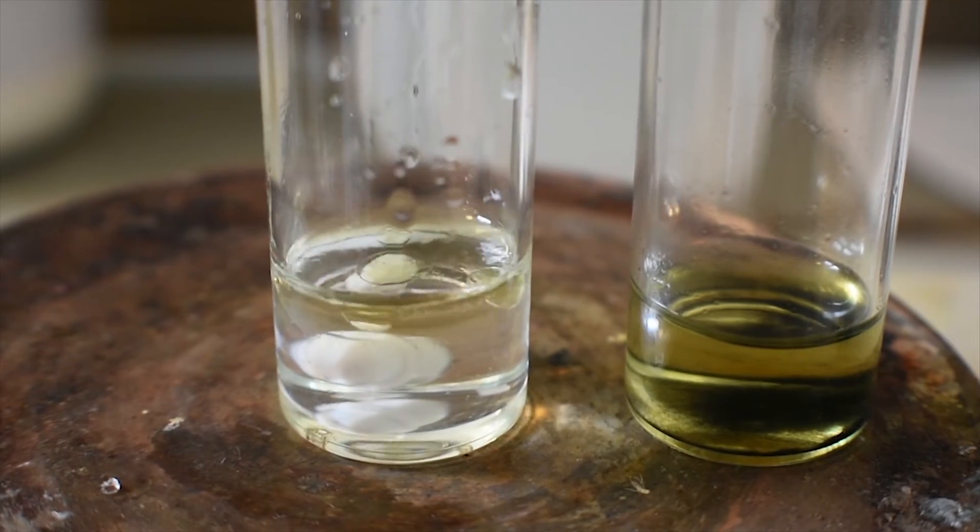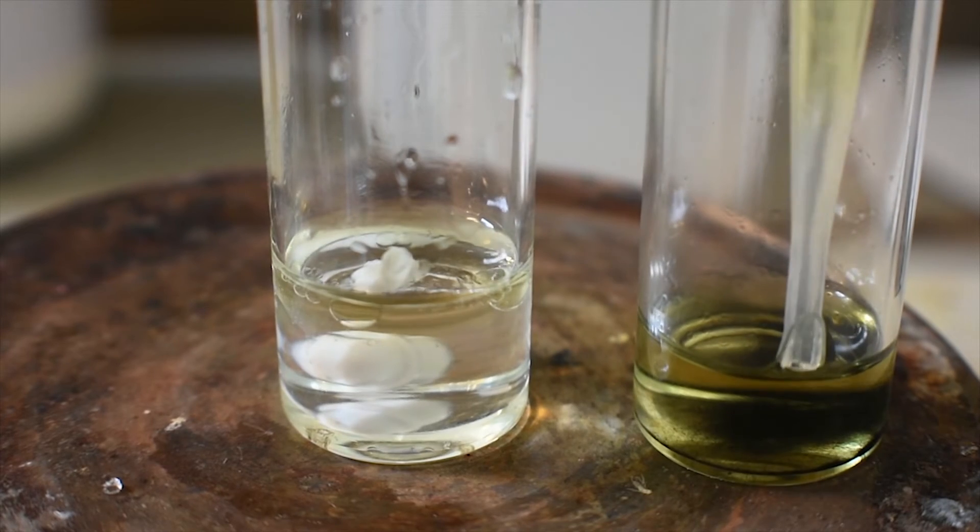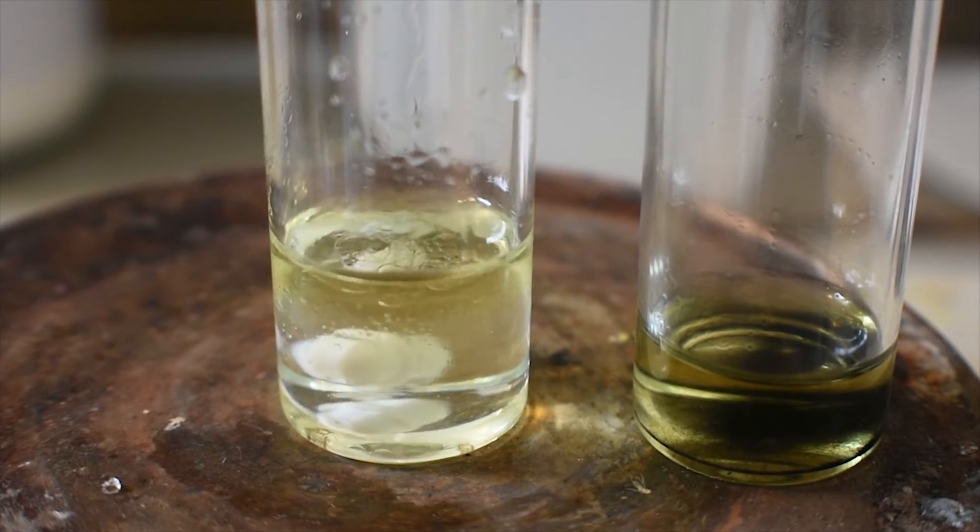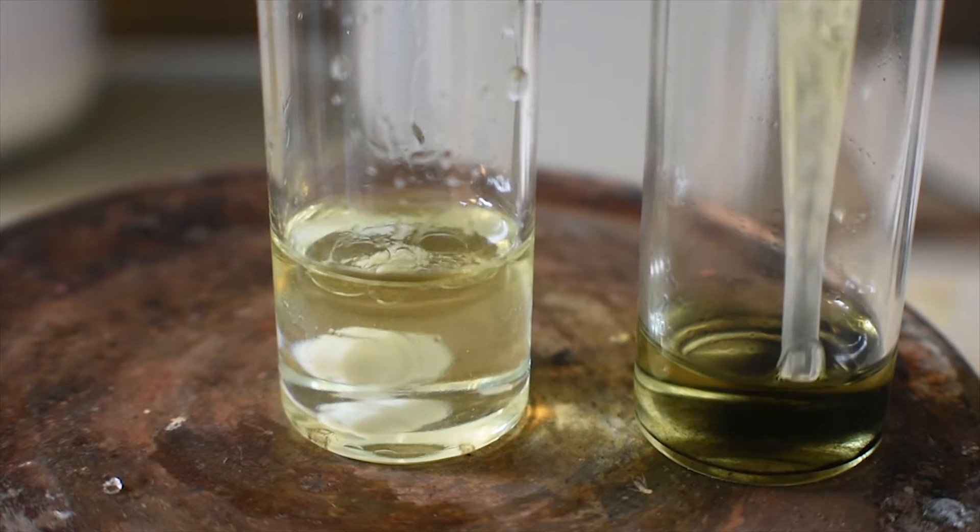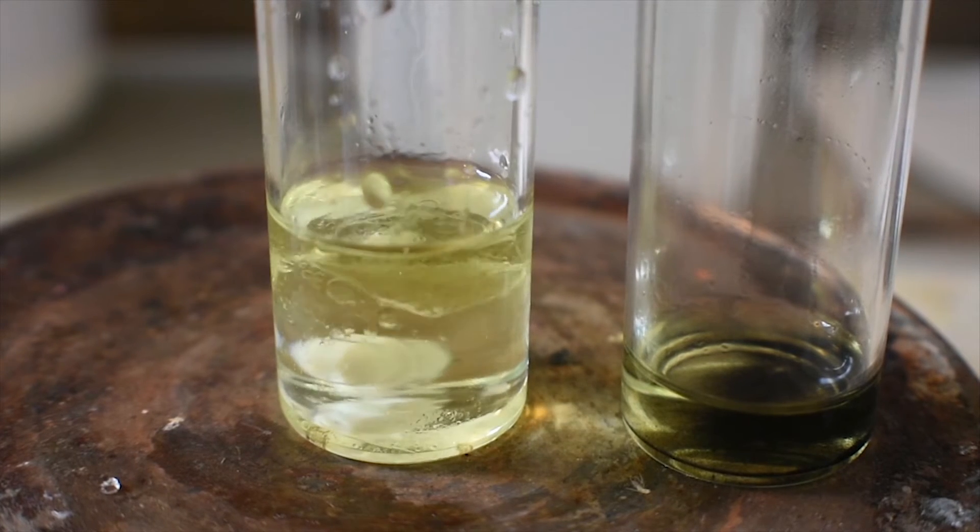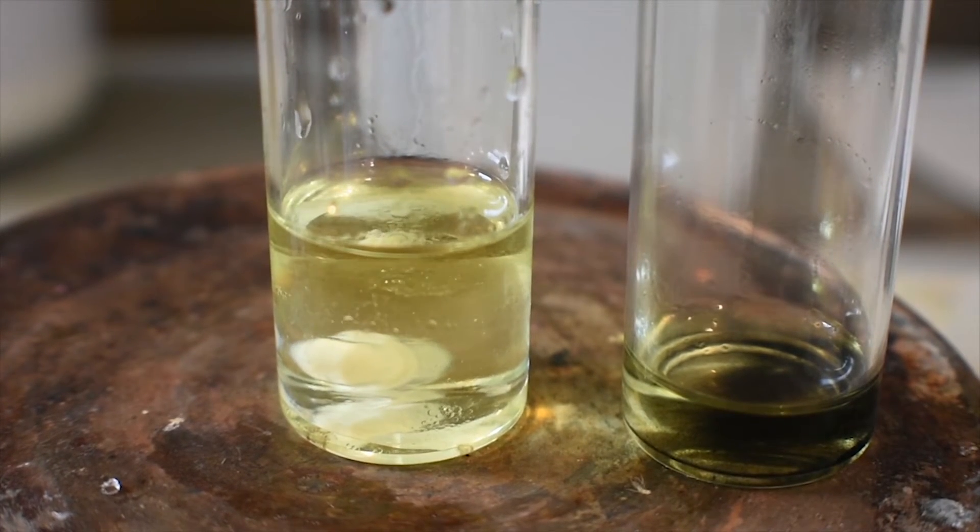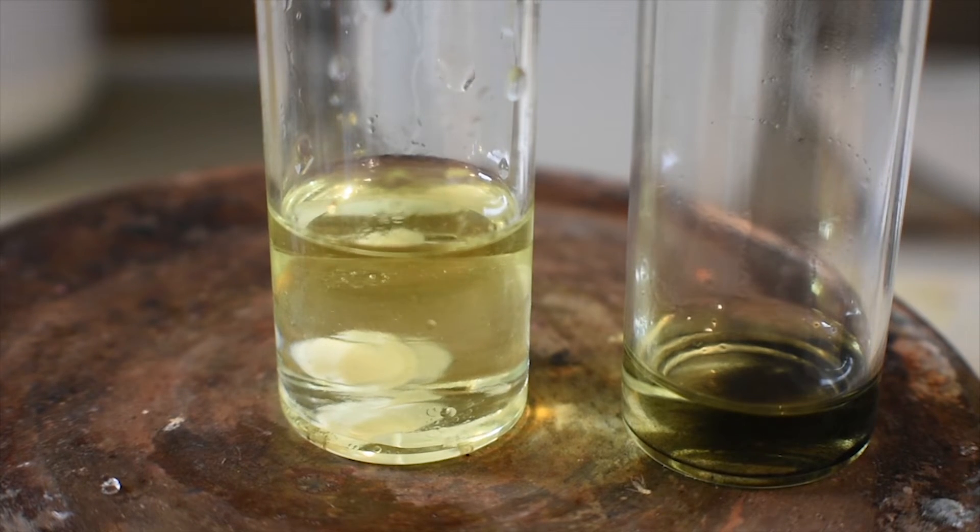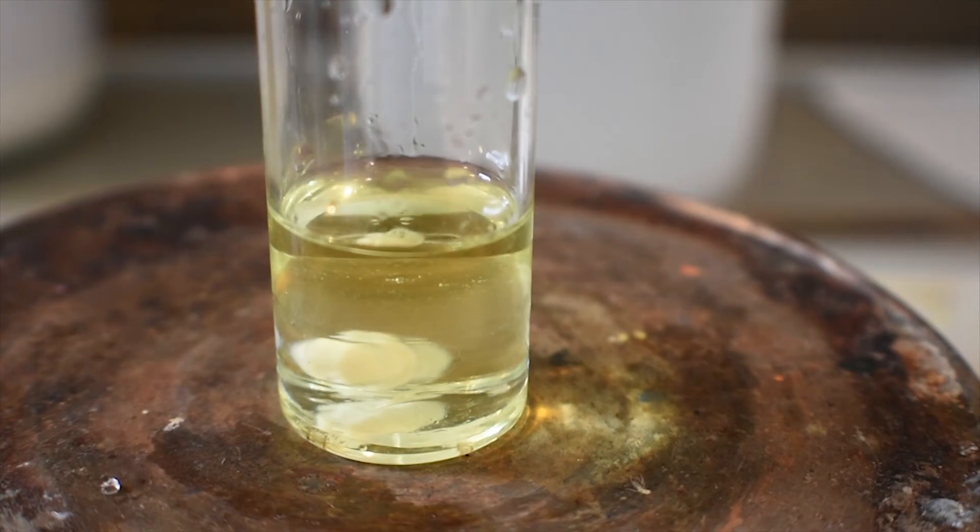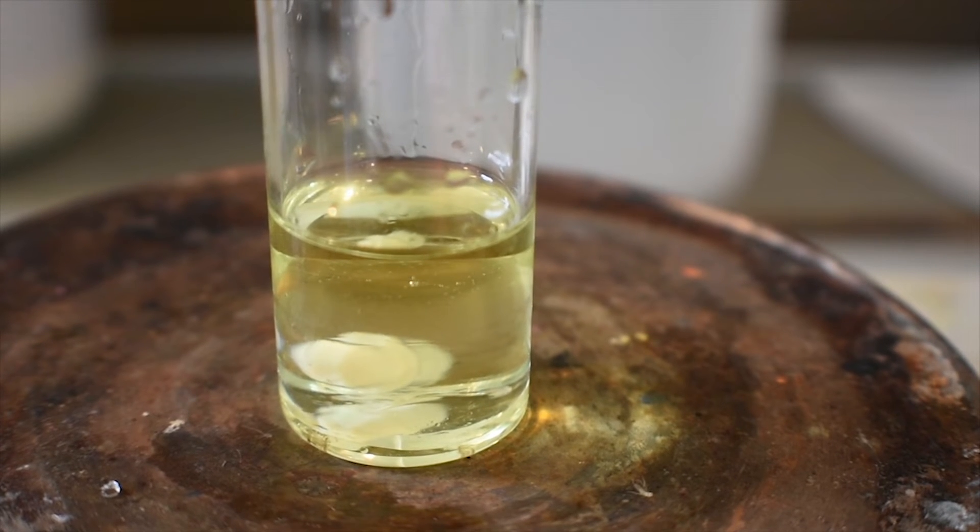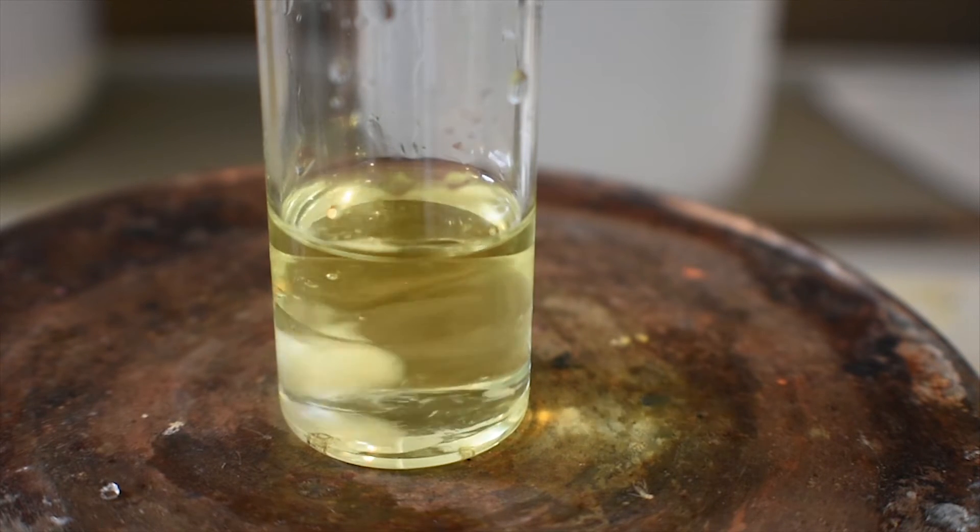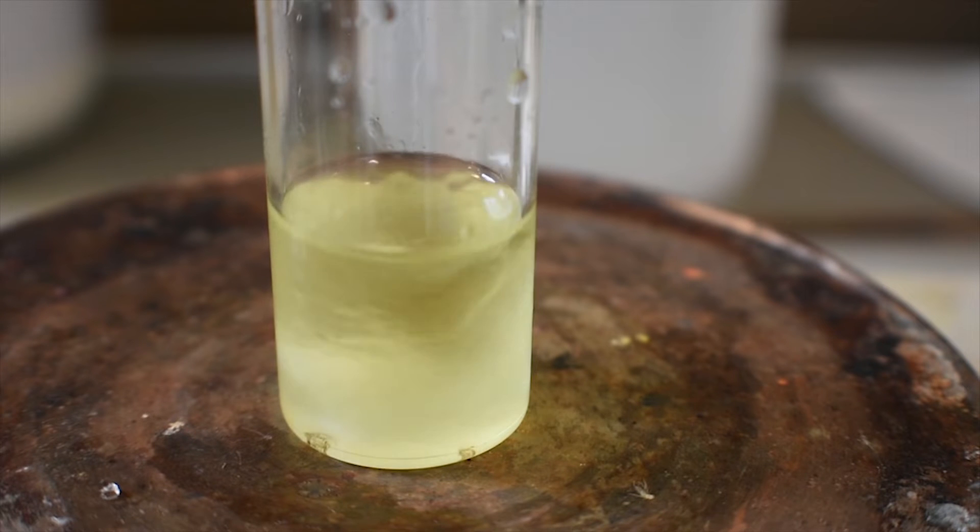Nothing should happen at first. That's because the layers are immiscible and no complexation can really occur unless the two layers are mixed intimately. That's probably about good. What I'm going to do now is stir this to complex the uranium. Stir vigorously, I should add.